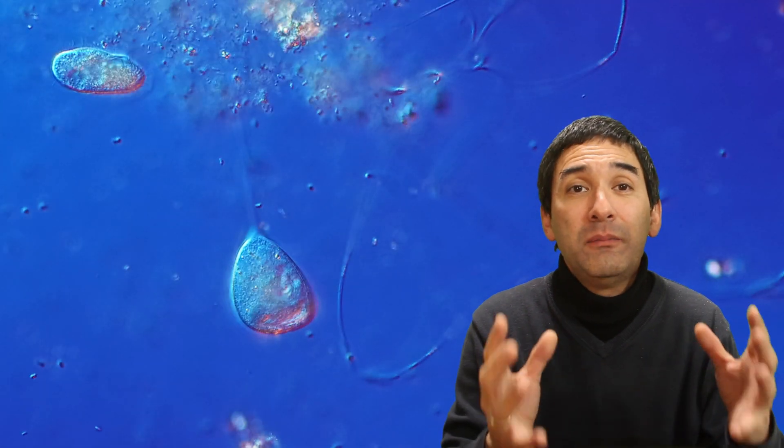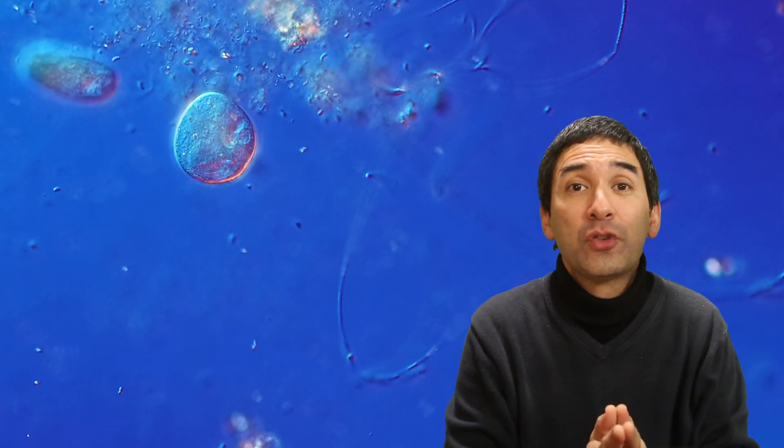Now, paramecia are oval-shaped and can move around using the cilia, but the vorticella, they look quite different. They have this bell-shaped structure, and in many cases, they are attached to a surface.